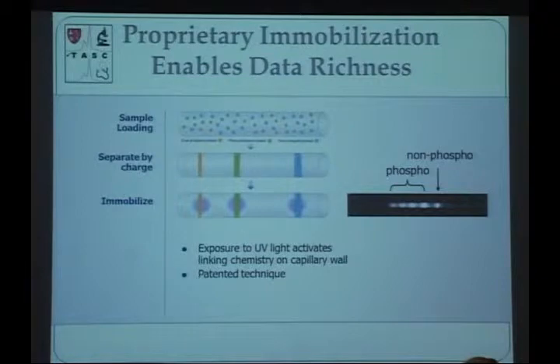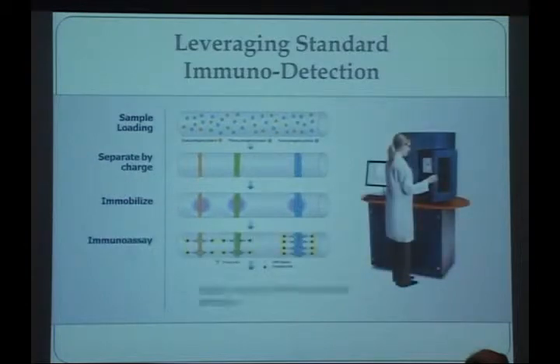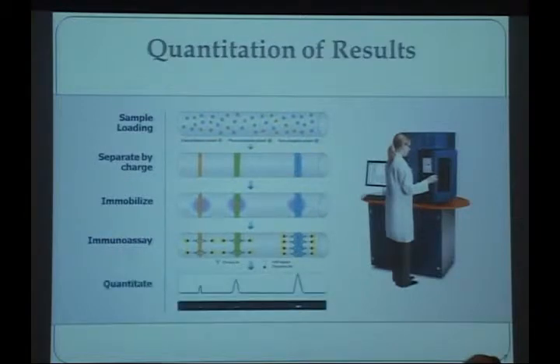So you lock them into one place, and that basically allows you to then wash out the contents but leave the proteins there, and then do all kinds of different manipulations, such as incubate with specific antibodies that you're interested in, followed by your secondary antibodies, followed by luminol and peroxide, which will then cause chemiluminescent light to be detected by a CCD camera, and that can be captured.